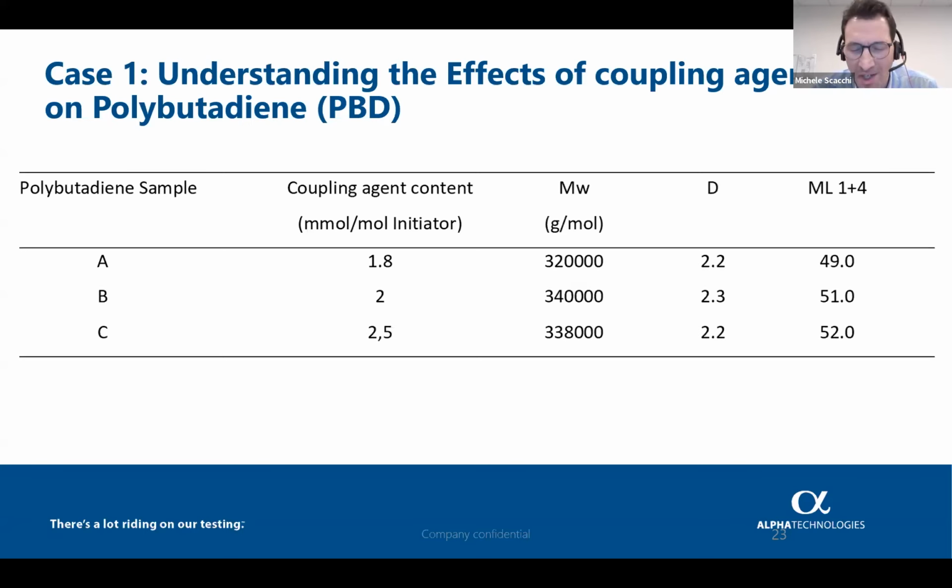Probably in the future we can also provide a slide deck for this topic. So for mixing, we have created a specific test method that can be used to determine the filler dispersion. So it's very useful for mixing.